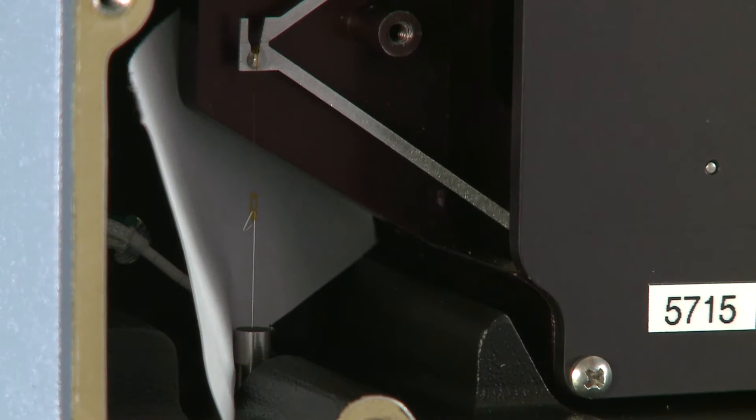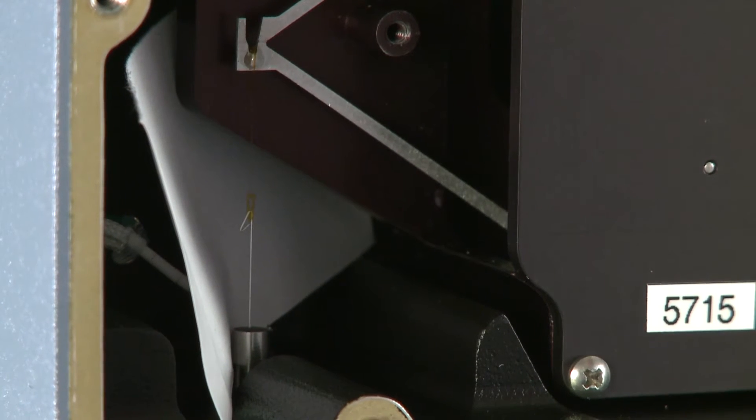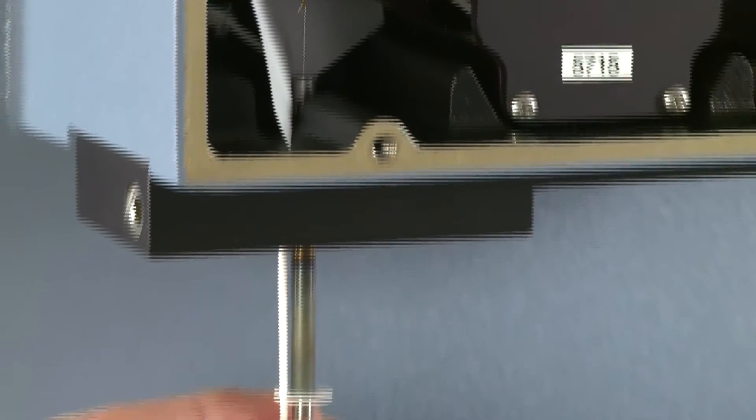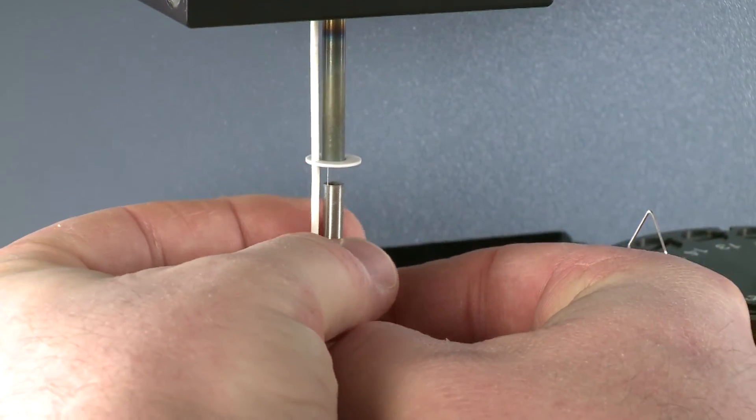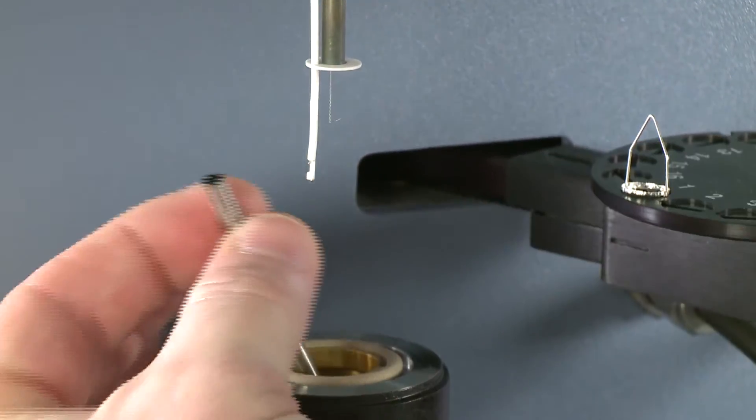Now we've got it in, we can lower our loading tube, making sure that as we get into the bottom, we don't bend the new hang down wire.